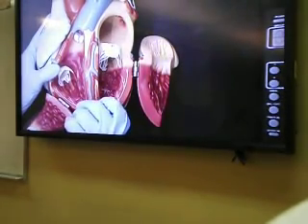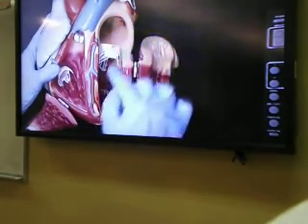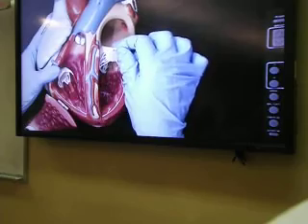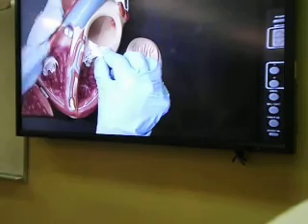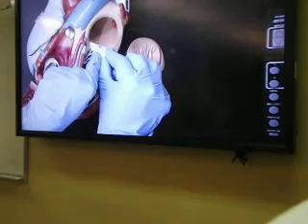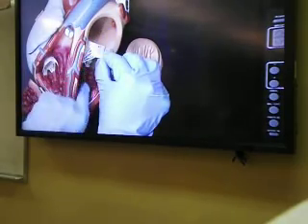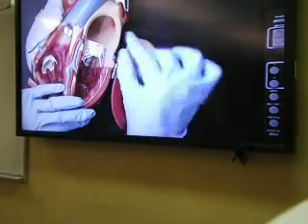And once the left atrium has the blood, it will follow gravity and come to the left ventricle from the left atrium via the open bicuspid valve. This valve is about the same type as the tricuspid, but it has 2 flaps, and the valve is a little bit thicker than the tricuspid because this left side is more muscular. Everything on the left side you will see is a little bit thicker than the right side.